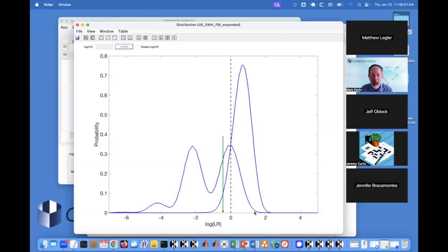It can't distinguish between the two. So when you don't give the system enough data, and 24 peaks over 21 loci is not much data for a mixture, you'd ideally like to have 3 to 4 allelic peaks plus stutter, the result is the system really isn't able to distinguish between contributor and non-contributor.